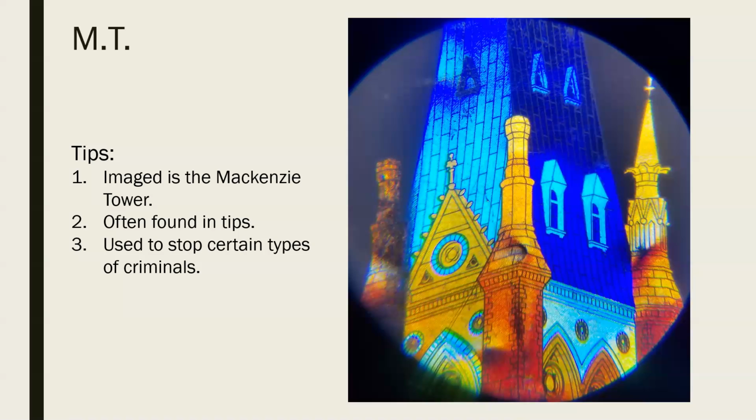So either it's because the objective splits those beams into the two eyepieces, and it takes the discrete rays of light from each point and causes these different colors depending on which part you're looking at. Either that, or it's due to the prism, or a combination of the two. I'm completely unsure, but that's just my own reasoning behind it. I reserve the right to remain wrong.